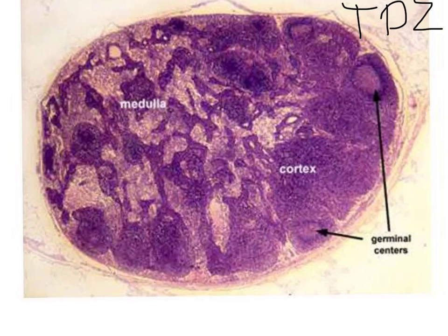The T lymphocytes come from the thymus. How do they leave the bloodstream and reach this area of the cortex? This takes place through what is called the post-capillary venules. Here we have venules in this area, and these venules are lined by cubical or high cubical cells that have receptors that identify the T lymphocytes and allow them to pass to the thymus dependent zone.